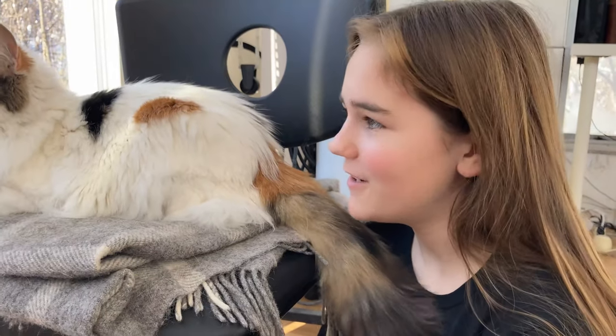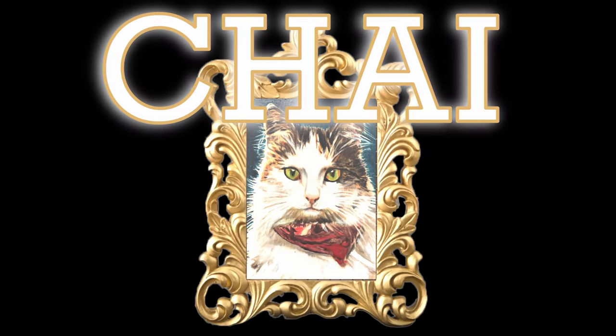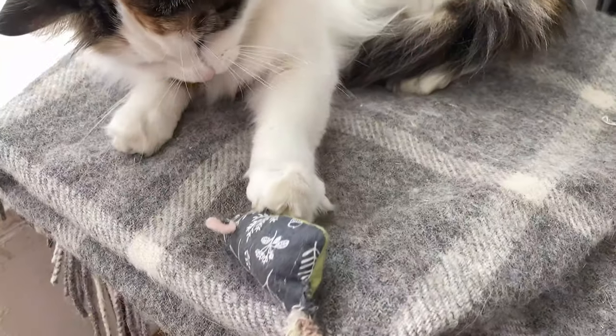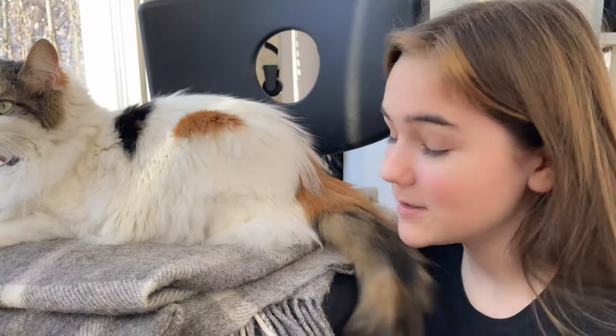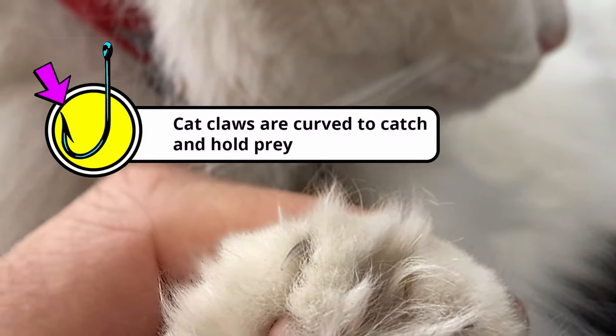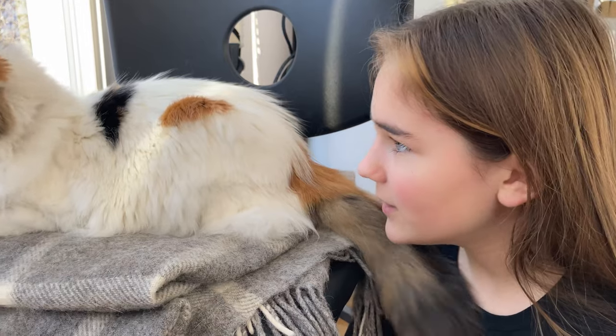Back again with my favorite test subject. She always scratches me quite a bit in these videos, so I was like, hmm, I wonder if these claws of hers aren't really that sharp underneath the microscope. So that's what we're going to do.